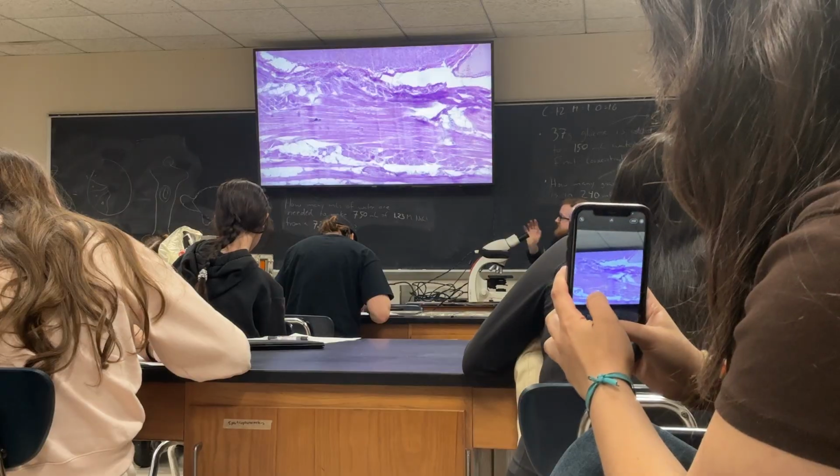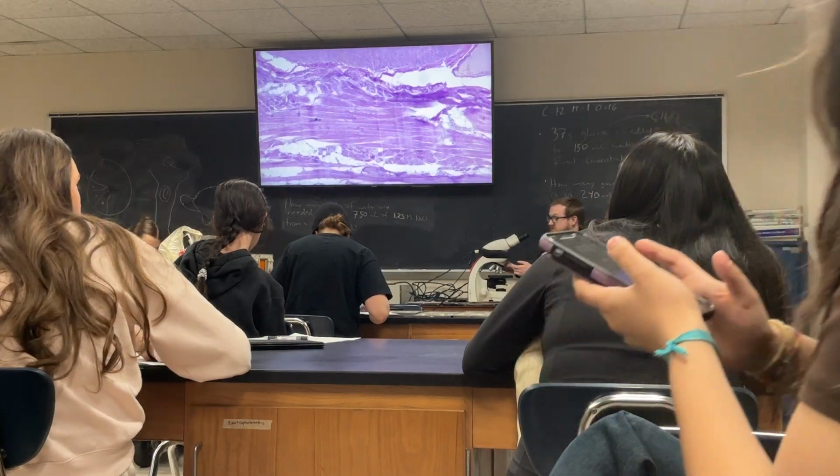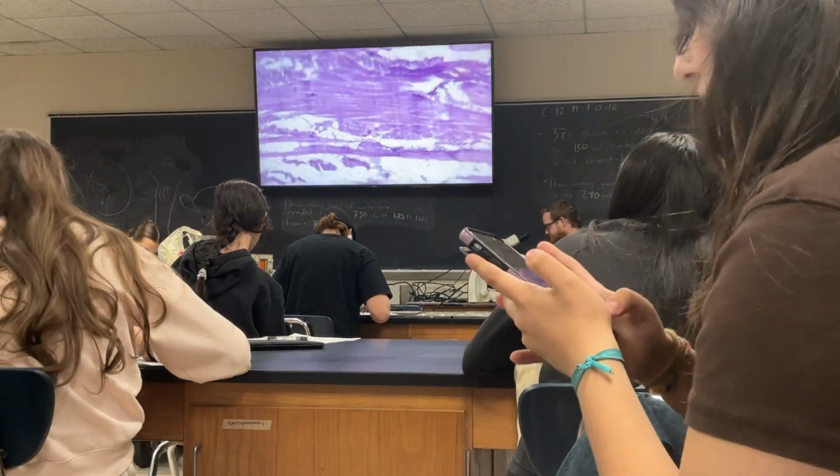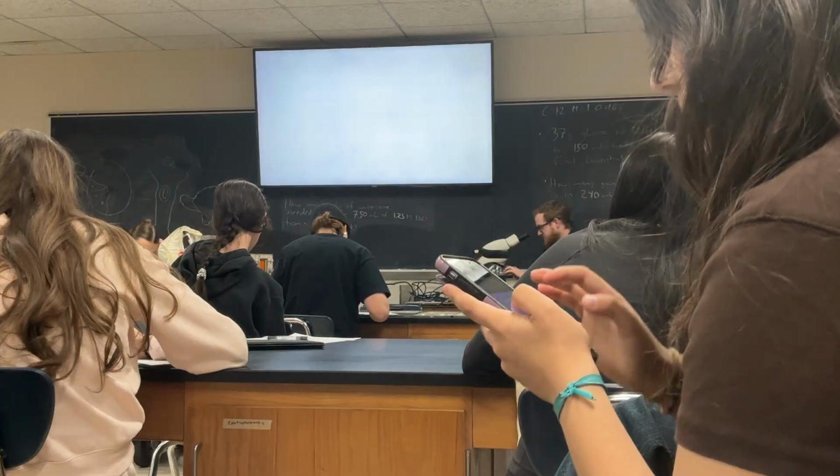Now, ideally I would have been able to find, the reason why this is a problem is because I don't see a lot of nuclei, and I also don't see the striations super well, so let's see if I can find it. But I think I'd still need to be fair for the tests.